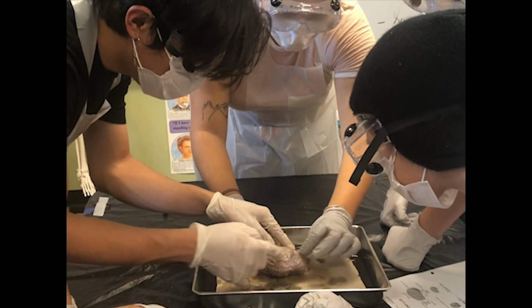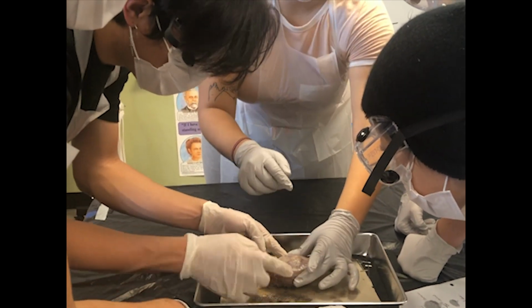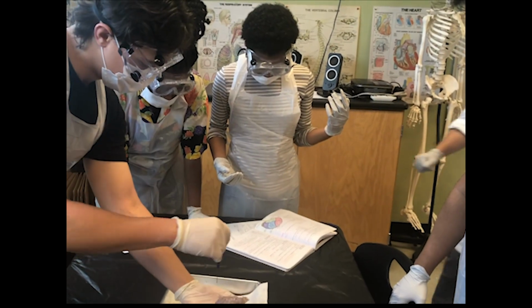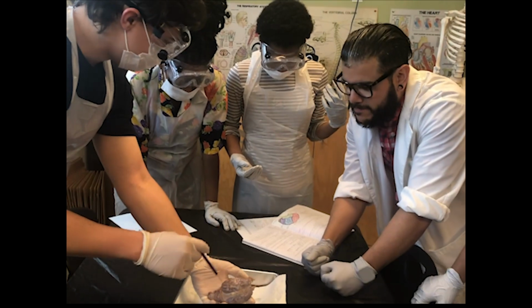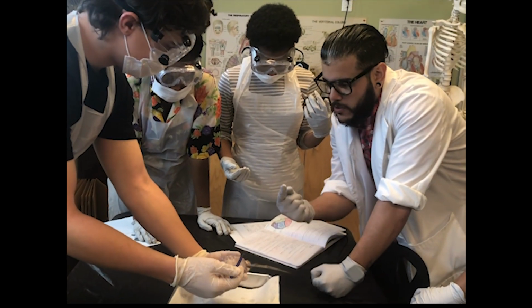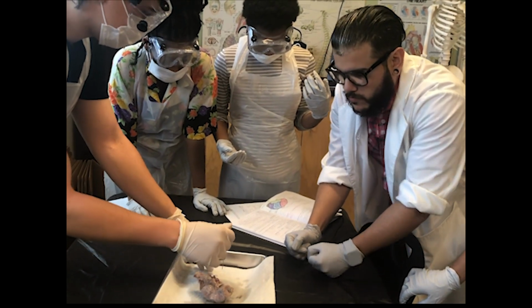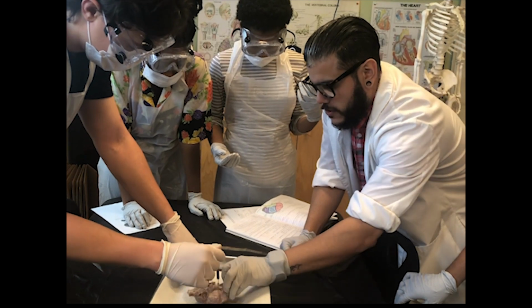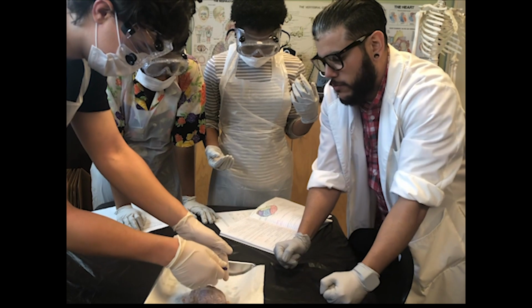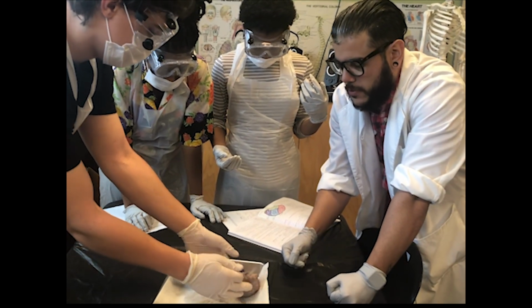This is the frontal lobe up here. The occipital is back here. The two temporals are on the side, and the parietal is in the middle, right here. Excellent. Here's the temporal lobe. Wait, there's only one temporal lobe? Well, it's one large region. It depends on the division you're talking about. There's definitely two temporal lobes. It comes all the way down here, with a little division where my fingers touch. Alright, so we got temporal out of the way.